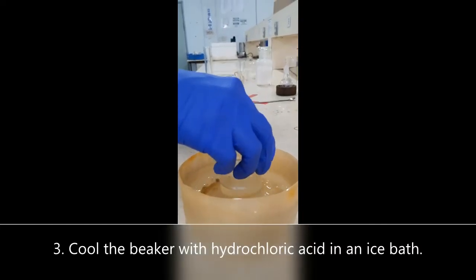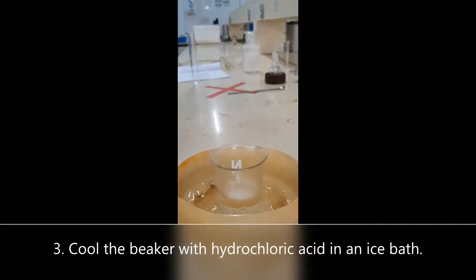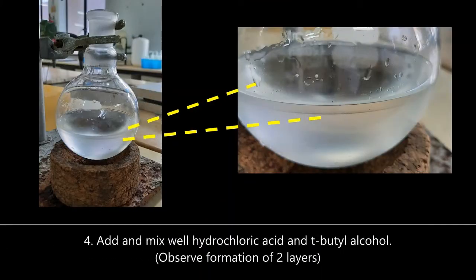Cool the acid in an ice bath for a few minutes. Add tert-butyl alcohol into the acid with swirling to mix them well. Observe the presence of two liquid layers, which means the reaction has occurred.